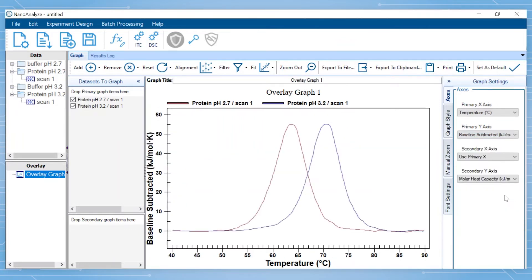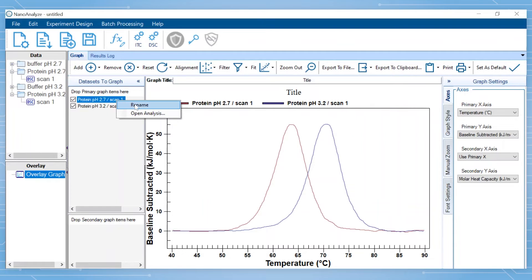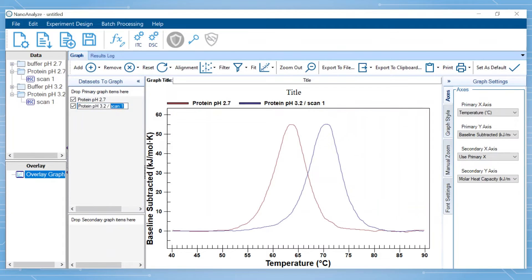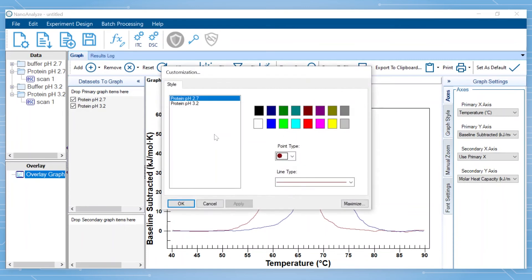There are also many other features within the overlay graph that will allow you to customize the image. For example, if you wish to change the title, this can be done in the graph title box. The names of the datasets can also be modified to update what is reported in the legend. The color and type of line for the thermogram can be changed by double-clicking anywhere in the graph.